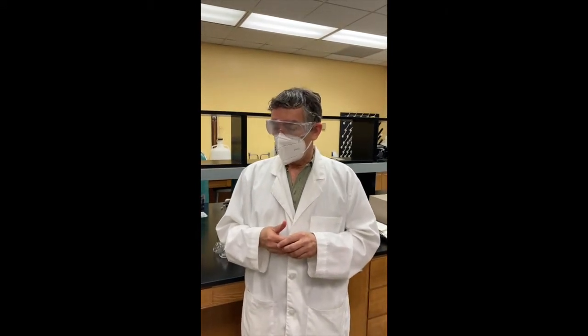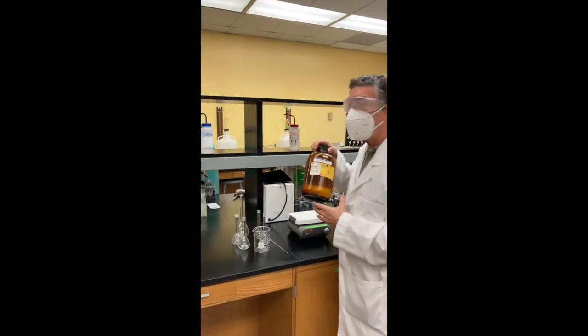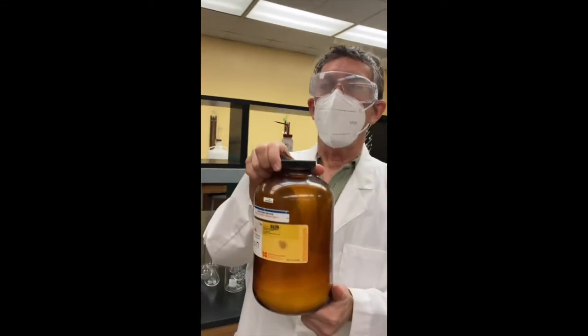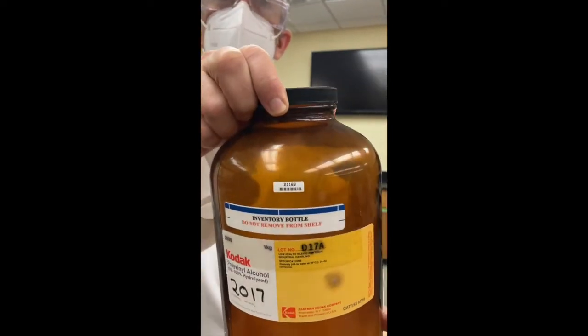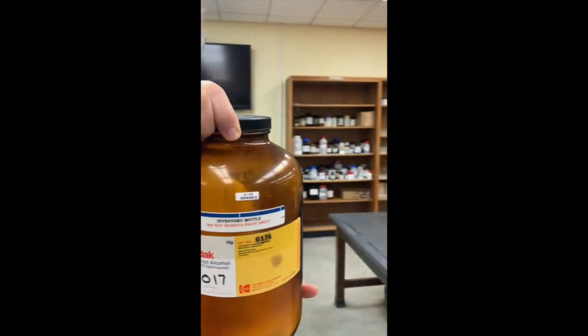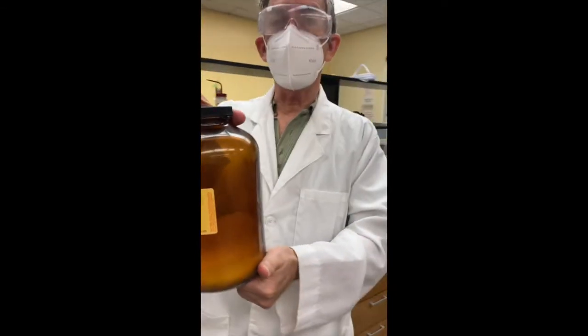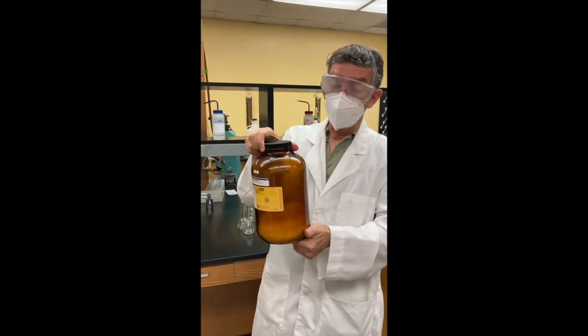So we're going to do this. We've got one particular polymer. It's polyvinyl alcohol. We have a sample here, but we do not know the average molecular weight of this sample. And so we're going to carry out an experiment that will tell us the average molecular weight. That will be our first goal.